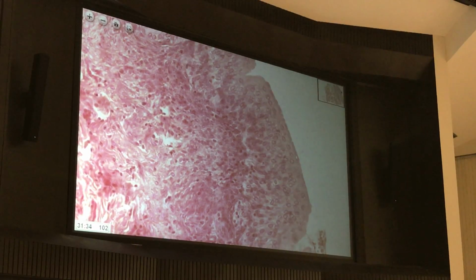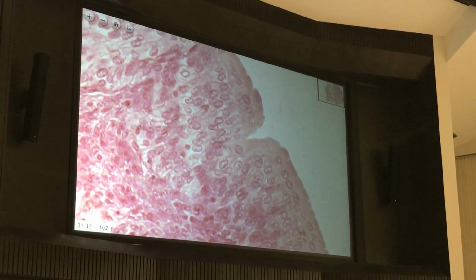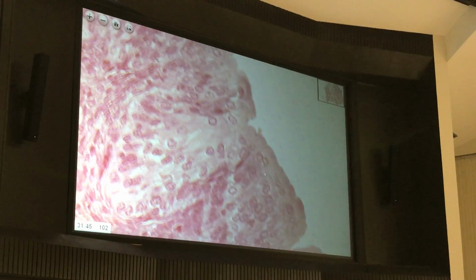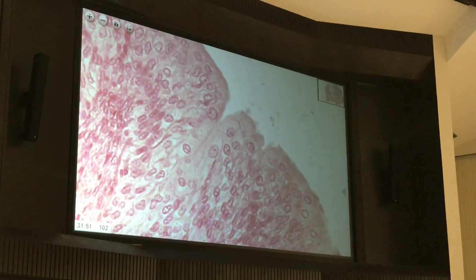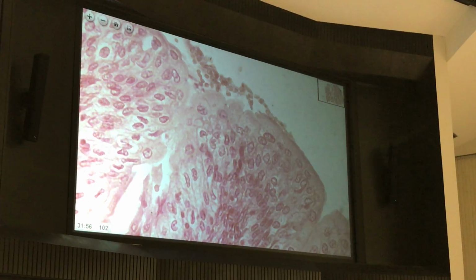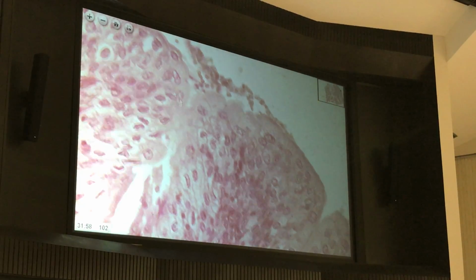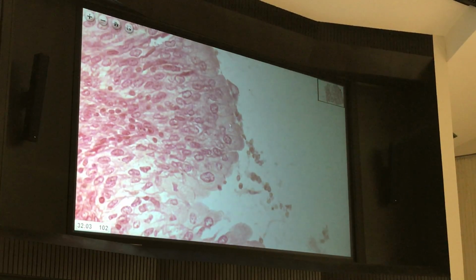What is this type of tissue? Kind of looks stratified squamous, if you will, but these outermost are very rounded. Almost look cuboidal. But you see, here's a nice one, and they kind of have this little puffiness to them. Right, that's transitional. Here's a little patch here, and there's a few there. See how they're just kind of these rounded, these are called umbrella cells. Remember, because if this was a stratified squamous, those outermost would be nice and flat. Right?